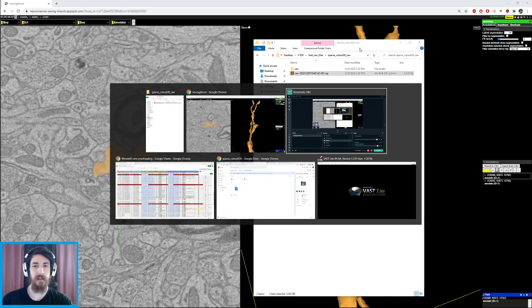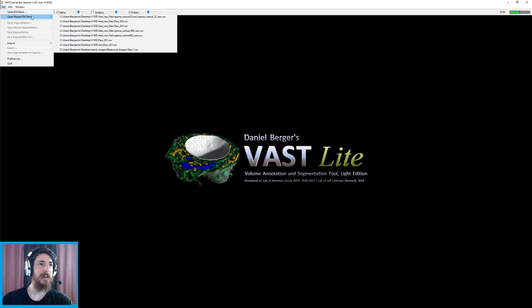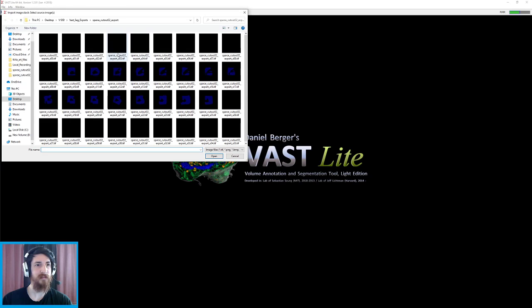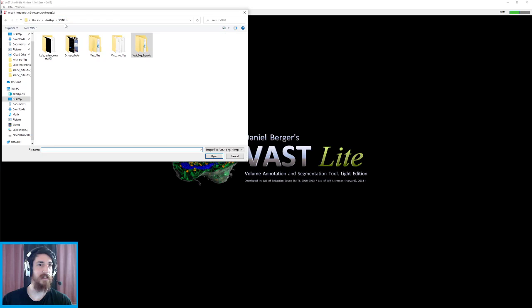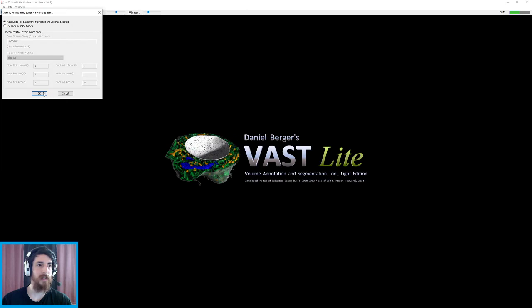Now we just need Vast, so we're going to open up Vast. We have it pre-open because we were ready for this. We don't have the raw file ready, so we don't have the EM file prepared, and we're going to have to prepare it. We're going to import it from the file that we just downloaded. So we're going to go to the raw files folder, open this raw folder, press Control A to select all, and open. We're going to say OK.